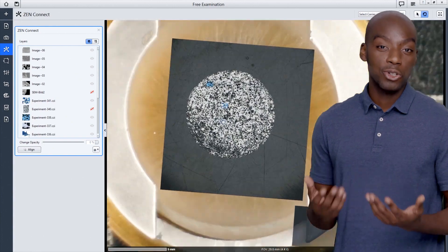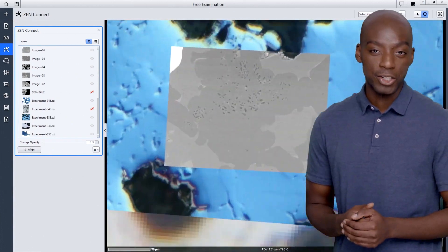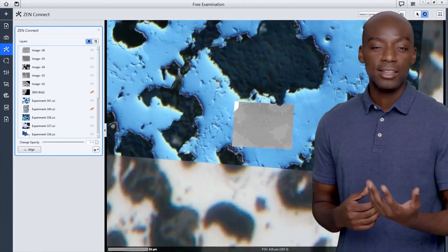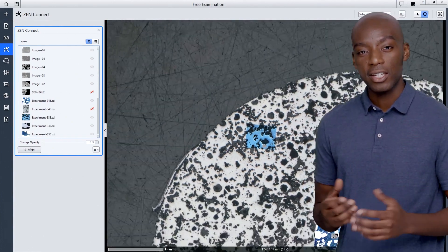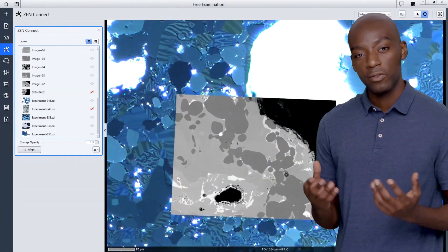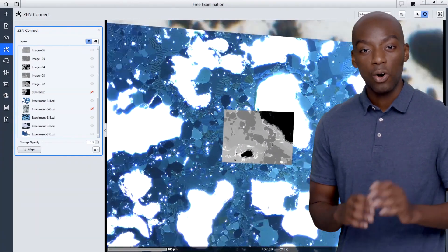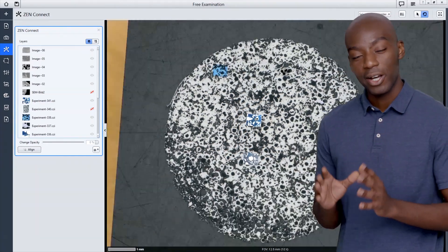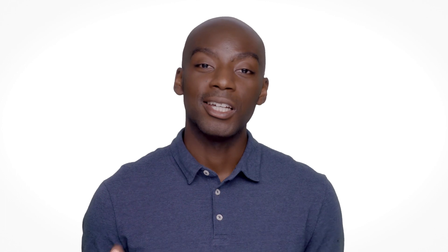Let all the users in your lab contribute to the examination. Let them easily navigate to the area of interest and information they're looking for, while keeping track of the entire sample. In short, with ZenConnect you stop focusing on systems and focus on your sample analysis.